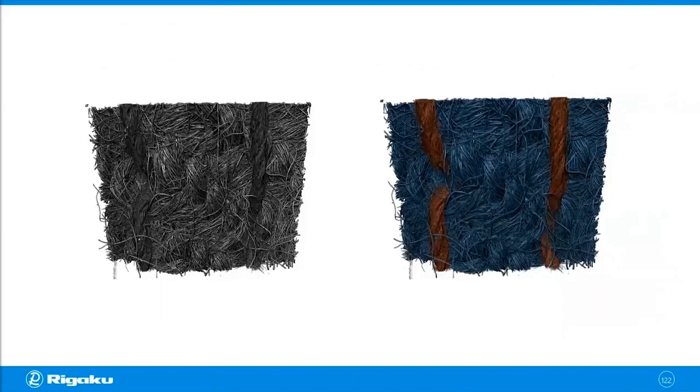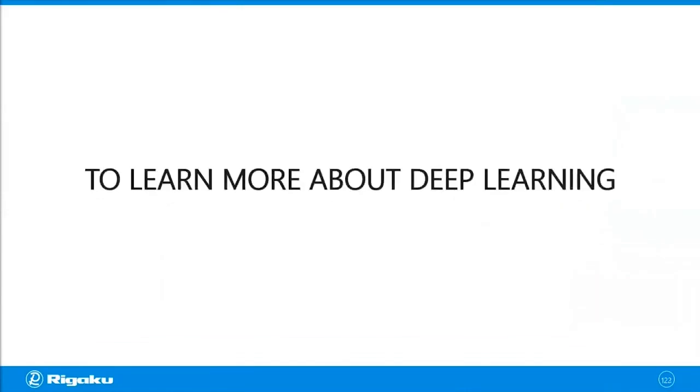So we barely touched the surface of deep learning. If you want to learn more about it, there are a lot of good resources. And we will put links to the resources I'm going to show you in the following slides on the Rigaku webinar website. So you can go there and find those links.